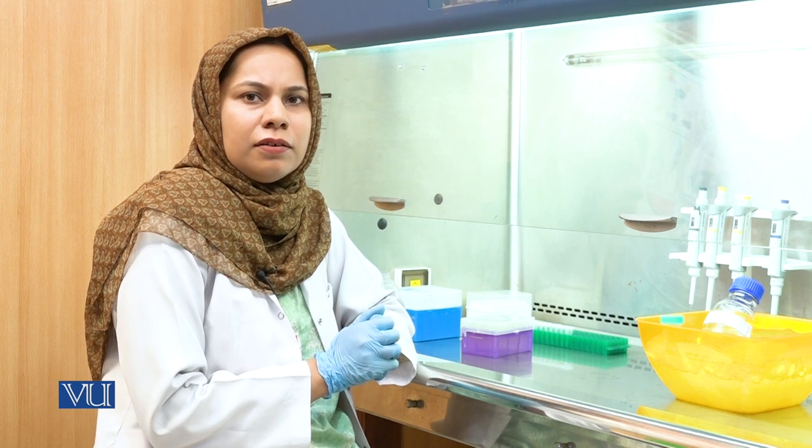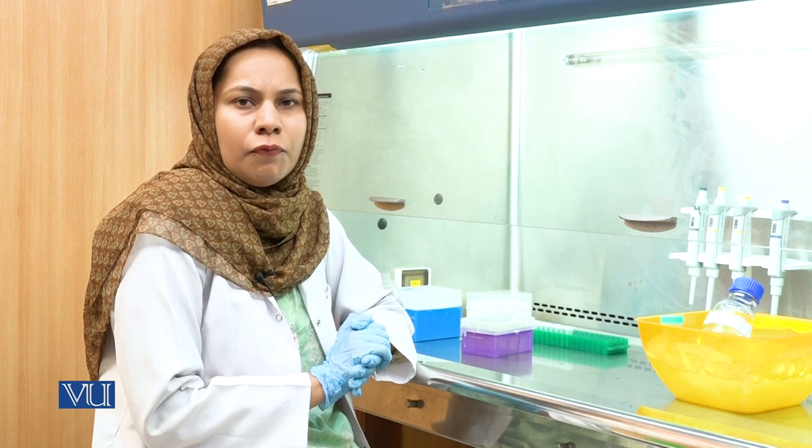One precaution is that we need to maintain 4 degrees centigrade or ice cold throughout the experiment. So all the solutions, all the tubes should be ice cold, and we need to handle the cells very gently. So when you shake this solution for dissolution of pellet, we should be very gentle. It should not be harsh.